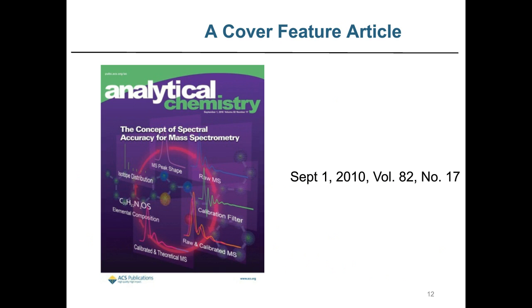If you're interested in the details of the mathematics here, it's actually quite simple. This is covered in a feature article published in Analytical Chemistry. It's available on our website, and is dated back to 2010. So it's by no means a new concept and has been well established in industry.